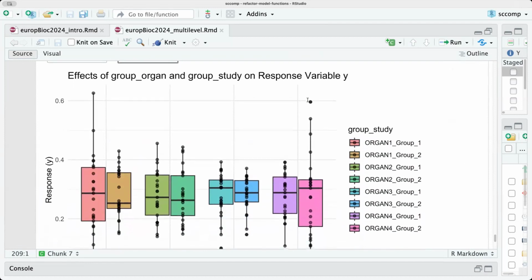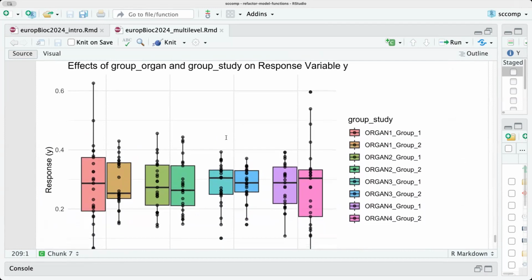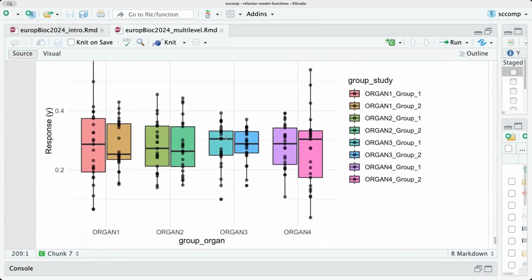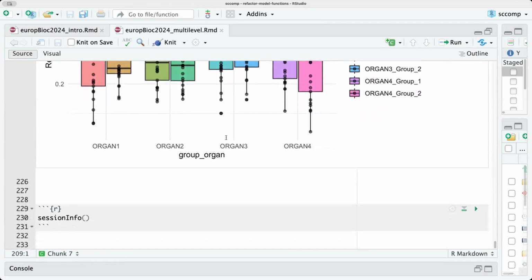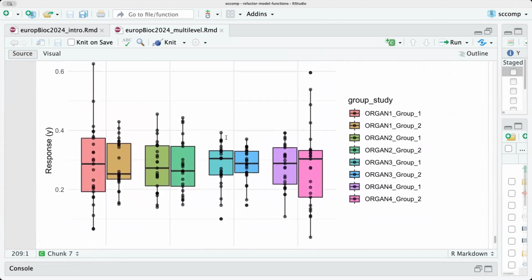In this case there is no association, because this is a dummy variable, so as you can see, there is no effect across organs. Anyway, this is just how you use the code. It is a very trivial example, but let me show you in the last 5 minutes how this works if you scale it up to thousands of samples from the Human Cell Atlas.